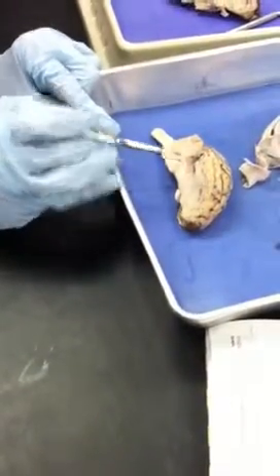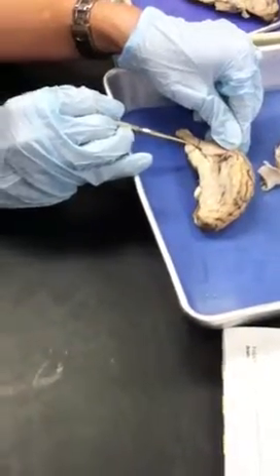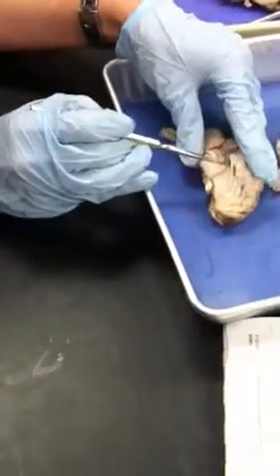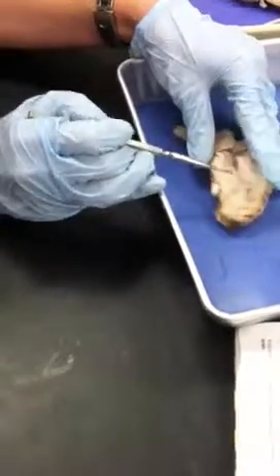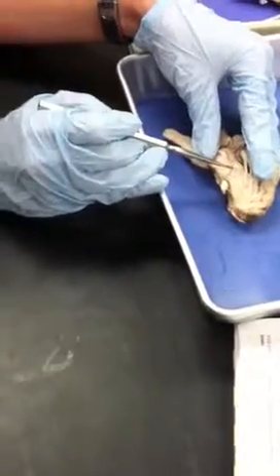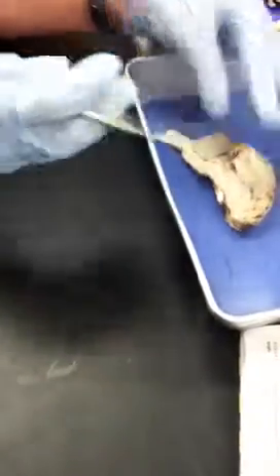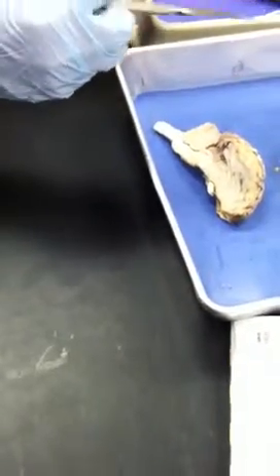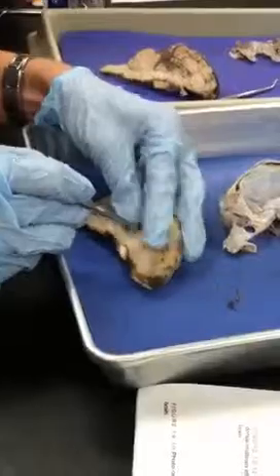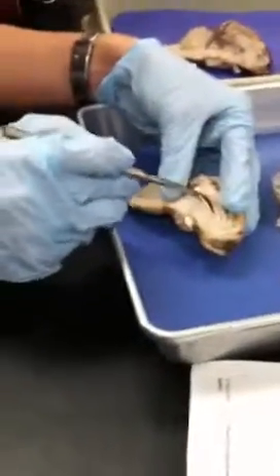The fourth ventricle is underneath the cerebellum. The third ventricle is basically around the thalamus in here. You can't really see it very well on a sheep. This is the thalamus. This is the interthalamic adhesion, the part of the thalamus that runs across the midline and keeps the two halves of the thalamus talking to each other. Lateral ventricles are inside there. Oh, so that is a ventricle. So the lateral ventricle is the big hole.